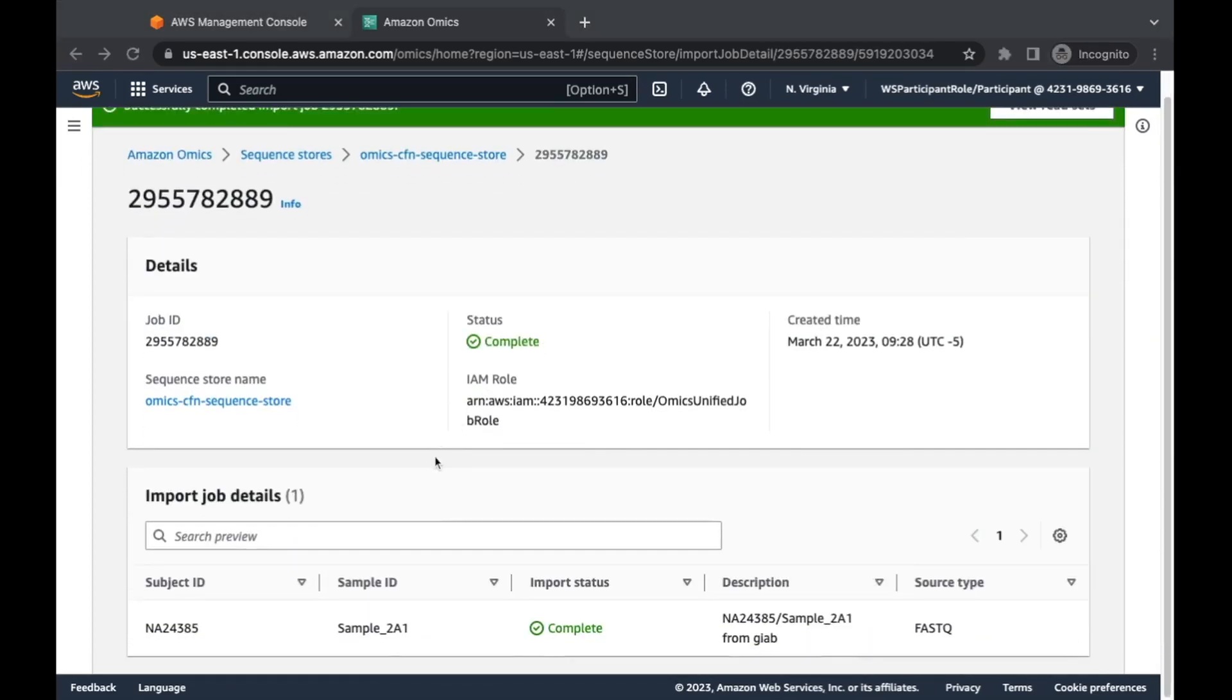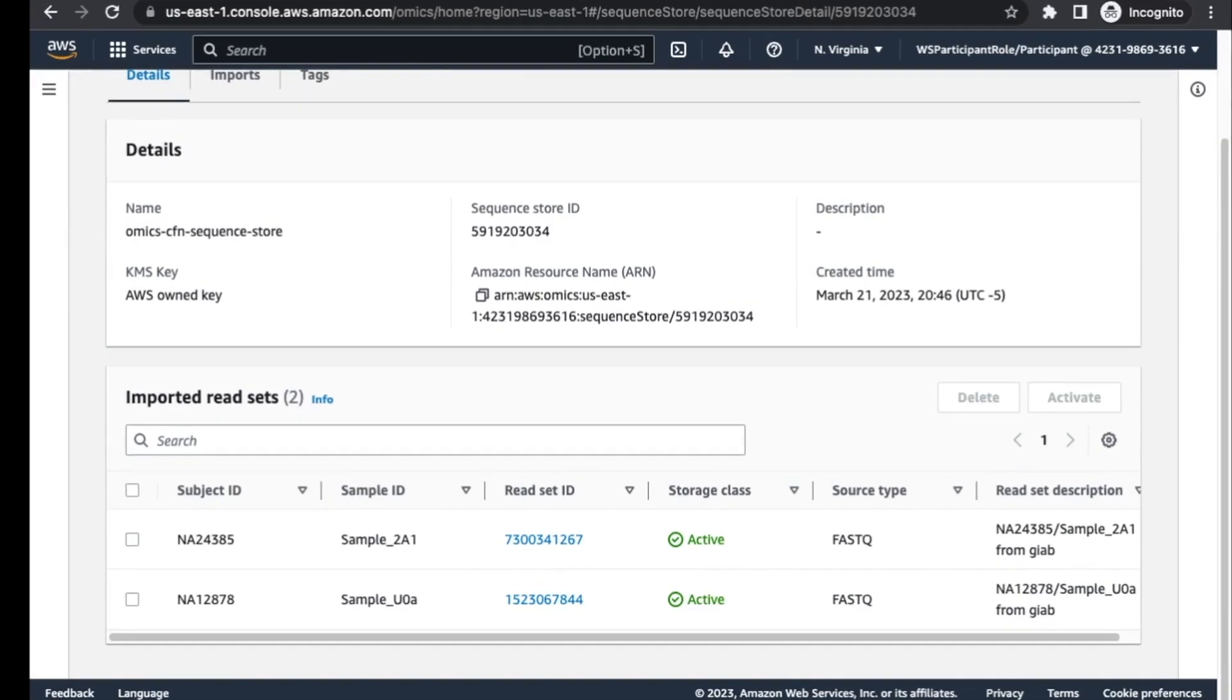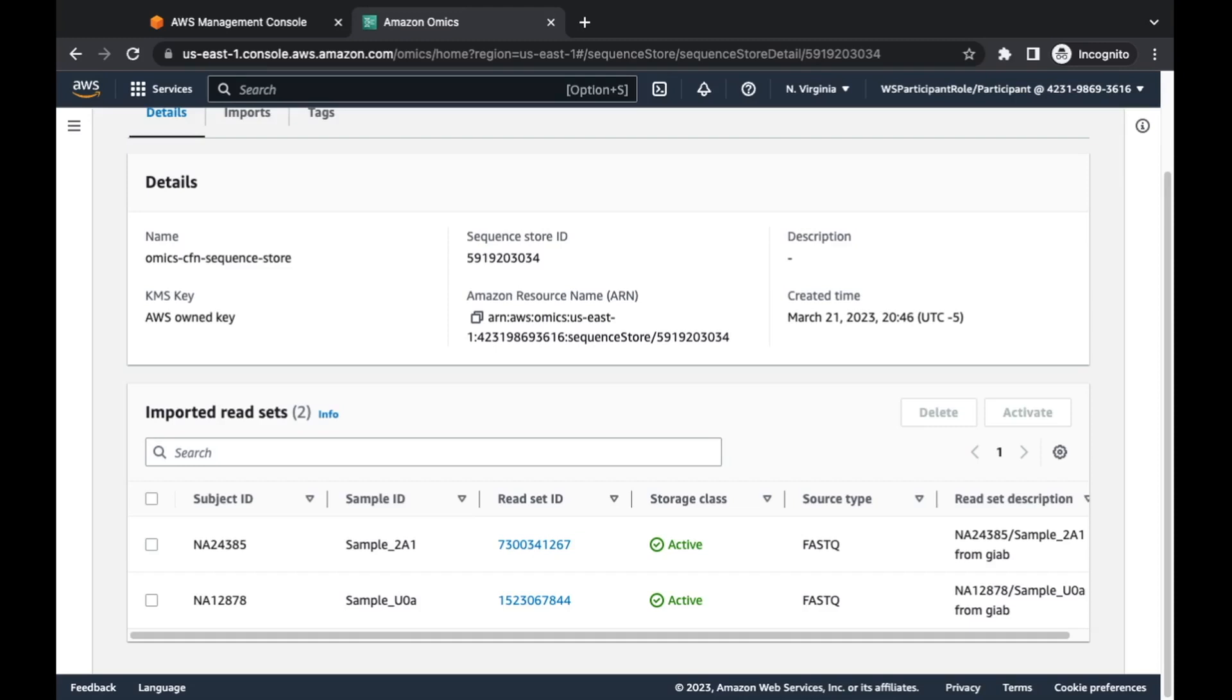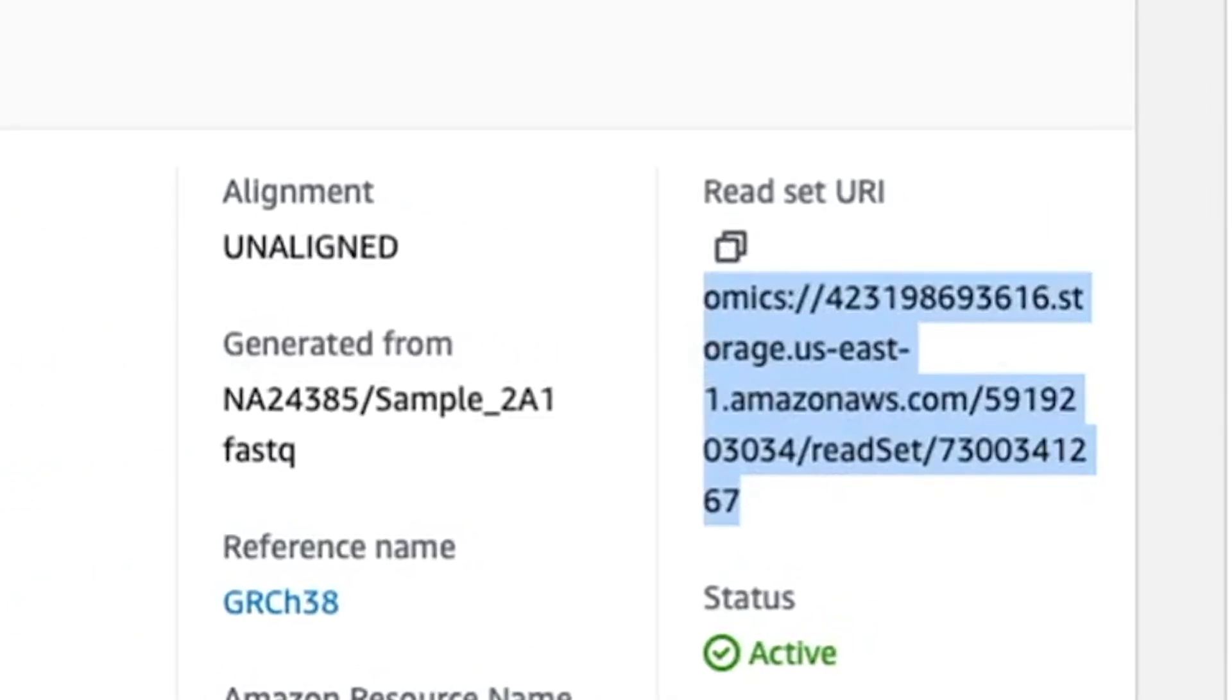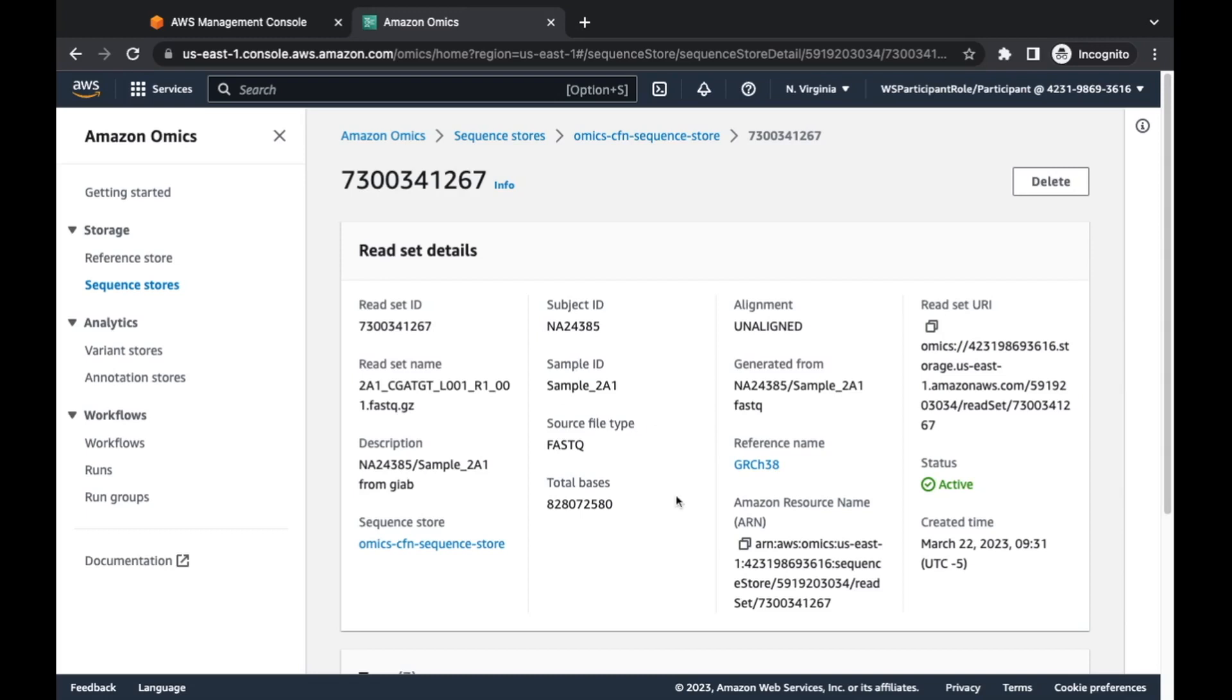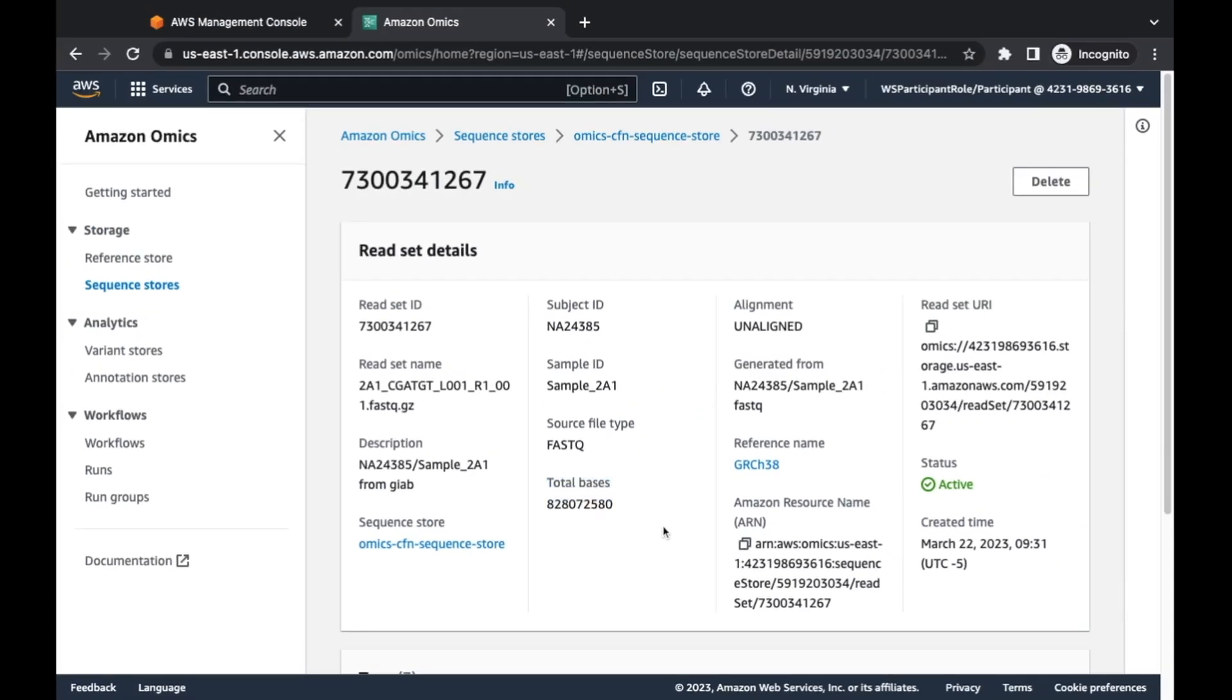And so I'm going to pull a manifest file here for HD02. If we pull this in, this is another sample. This happens to be one of the Ashkenazim trio. You can see the subject ID, the sample ID, some extra description fields and tags. And where this is important is we have a lot of customers who need to collect all of their samples and sequences for specific projects or cohorts. All of this metadata is there for you to help organize. Alright, so we'll create this import job. This will take a few minutes.